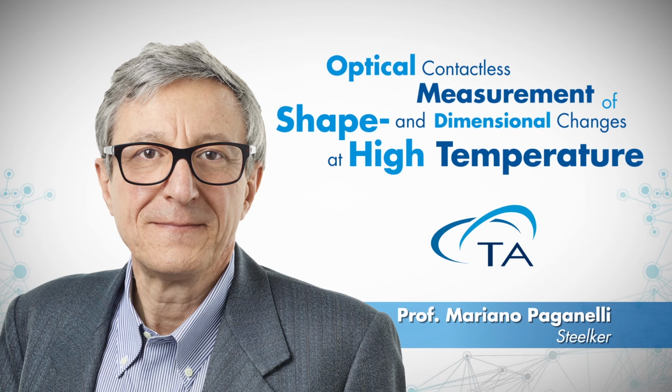What is the shape that yields the best results for heating microscopy tests? Well, in the past, we always suggested the 2 by 3 millimeter cylinder, because it proved to be the shape and the size that yielded the most reproducible shape recognition analysis. However, for many labs, this represents a hurdle because of the need to meet standard requirements, as for instance, ASTM, which asks for 19 millimeter pyramids, or ISO, which asks for 12 millimeter pyramid or cylinder 3 by 3 up to 9 by 9. No one standard regulation foresees the use of 2 by 3 millimeter.